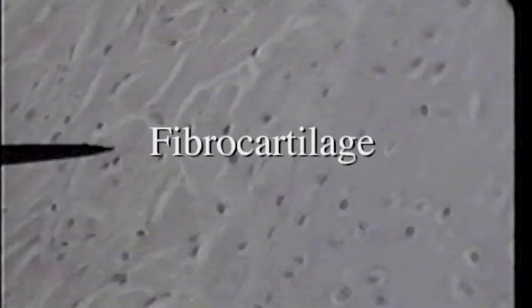We've talked about hyaline cartilage, where we can't see any fibers in the matrix, and elastic cartilage, where we can see elastic fibers in the matrix. There's one more type: fibrocartilage. In fibrocartilage, we can see collagen fibers in the matrix — collagen fibers are pink fibers, relatively large in diameter. On this slide we can see two types of cartilage: hyaline cartilage over to the right, and fibrocartilage where the pointer is. The primary difference is the streaky appearance of the collagen fibers on the left side.